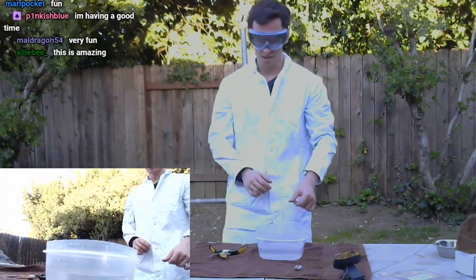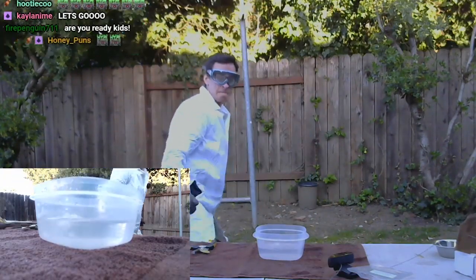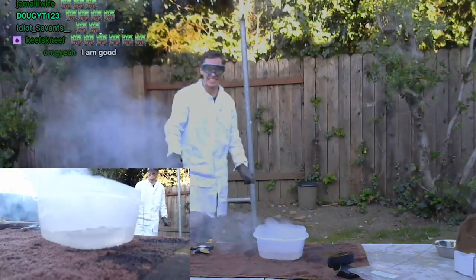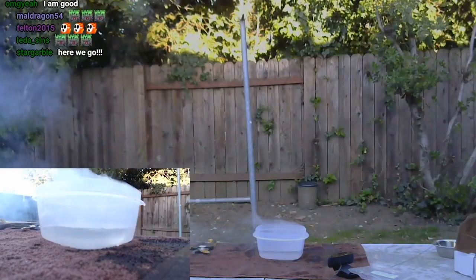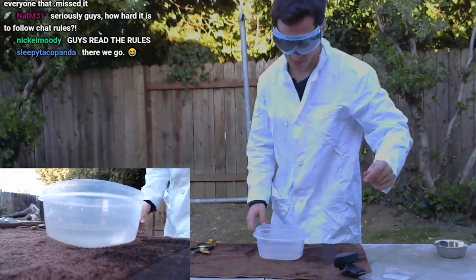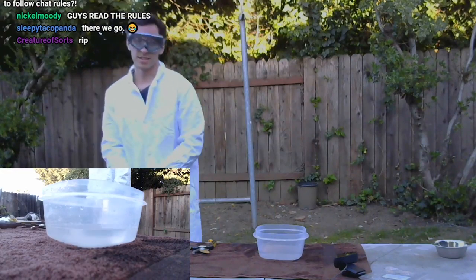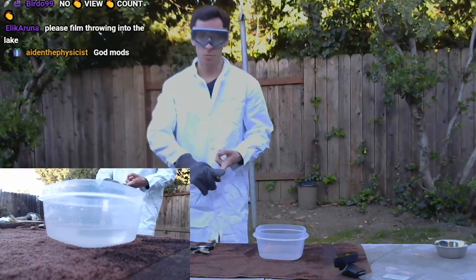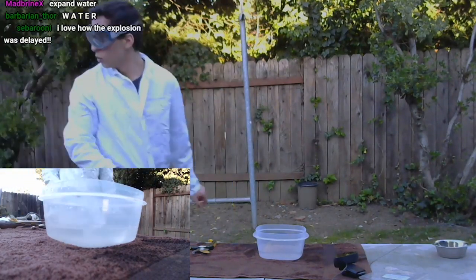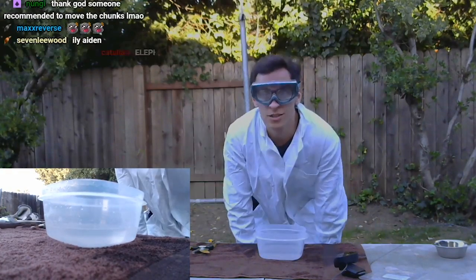Sodium again — smaller chunk this time. Woo! Science! We have a couple other things to do. Let me check on the bismuth really quick because that's our long-term project. Bismuth is going well — cooling down in a nice slow fashion, so we might get some really nice crystals.